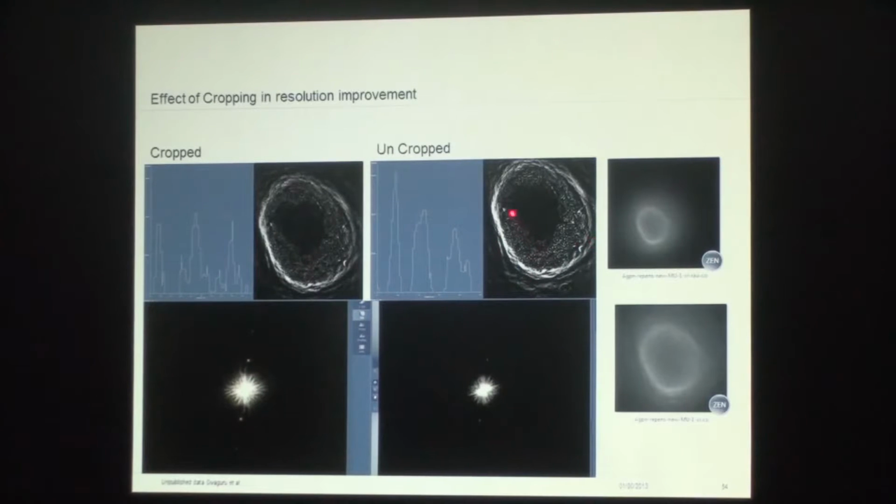The accurate calculation of the sample is much better, because as you can see, the objects are much more clearly defined. But when you look at the cropped image, the information is pretty noisy, and it is not as clear, because you didn't give sufficient information to the system to calculate the background signal to noise ratio.